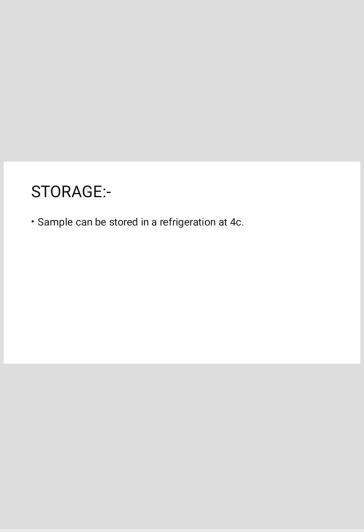Storage. How to store this pleural fluid? The sample can be stored in a refrigerator at 4 degrees Celsius.